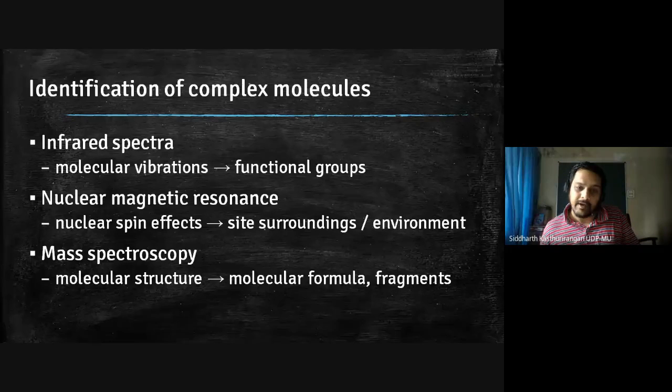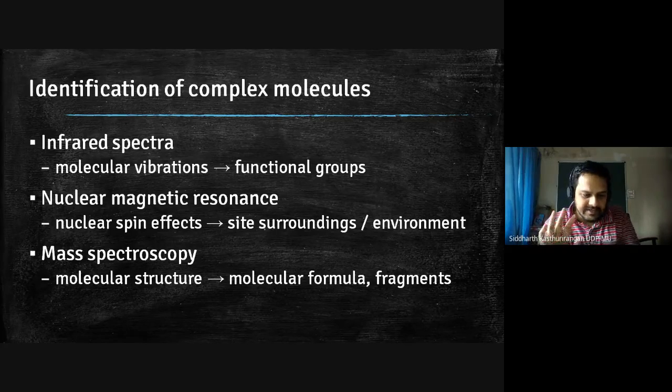Yes, this type of molecule it will be. Means is it a map of India? Is it a map of Maharashtra? You can find out by looking at specific features. That is the analogy as far as infrared spectroscopy is concerned.